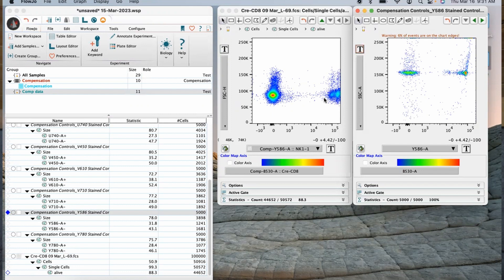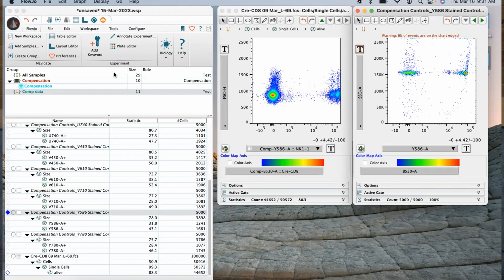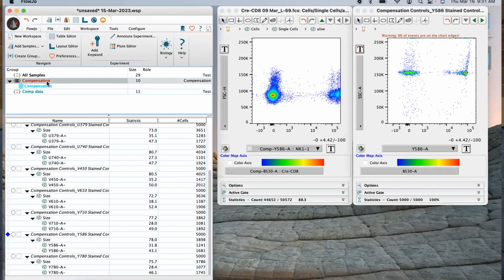So how do we fix this? Well, we can't, because the data is acquired and we can't change the intensity after acquisition. What I would recommend for this experiment in the future is first to go and titrate this antibody to bring that signal down. You can probably also decrease the voltage somewhat, but make sure that these two are more in line with each other so that your comp control is brighter than your sample and you aren't recording off-scale events. Off-scale events are never a good thing.